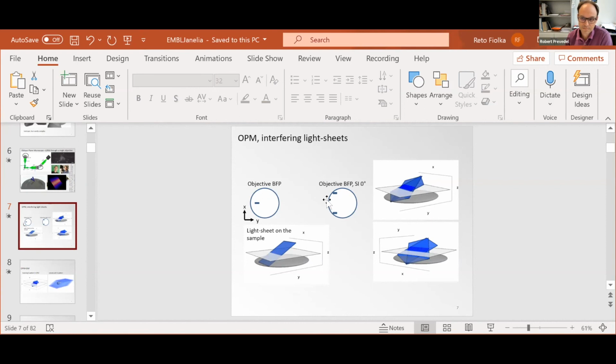So what we're actually excited about at the moment is photoswitchable fluorophores. I don't have a slide in here, but we essentially create positive and negative light sheets to activate the layer of fluorophores and then thin that layer with a deactivation light sheet that has a 0 around its center plane.